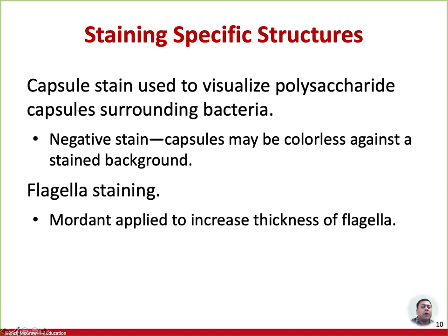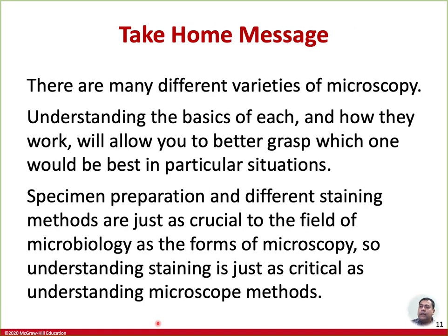Capsule stain, what are the capsules? We are going to talk about that as well. And then the take-home message: there are many different types of microscopy, which you have learned in a different chapter, but essentially the specimen preparation and different staining methods are just as crucial in microbiology for the understanding of this procedure. So that's pretty much all of the chapter, and we will wrap up.